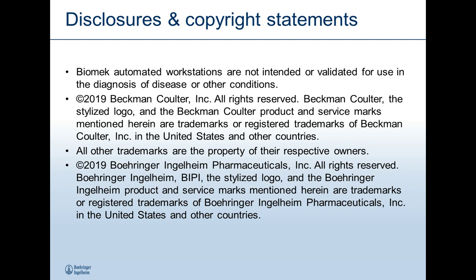Also, using new tips for every sample is an easy way to avoid cross-contamination. Using barrier tips is another way if you're working from more of a molecular biology standpoint or a phage standpoint. Barrier tips would be a necessity. I work a lot with cell culture supernatants and hybridoma cultures, so we have HEPA enclosures around several of our liquid handlers to reduce broad contamination overall. Like I said, it depends a lot on the types of samples you're working with and the types of contamination or cross-contamination you're worried about, but there's usually multiple ways to approach those problems.